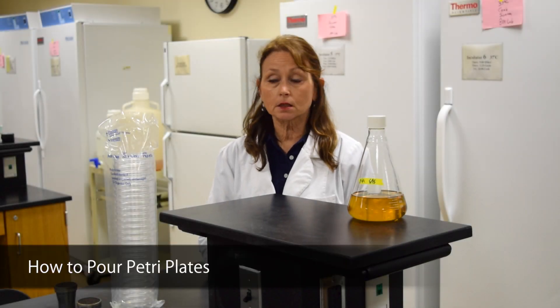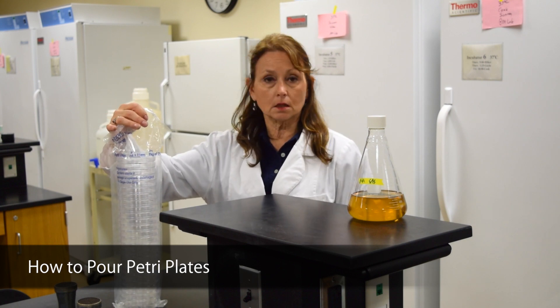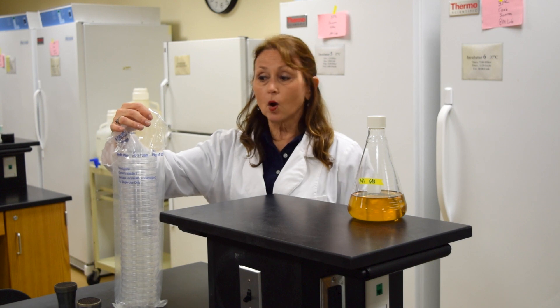This demonstration is to show you how we pour petri plates. Petri plates are sterile. They're found in these sterile plastic bags and they're used only once.